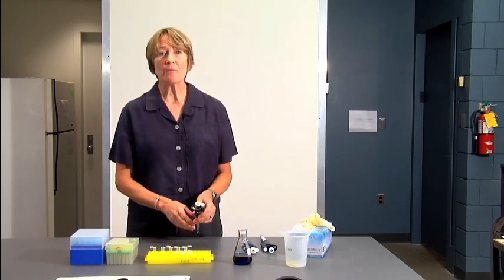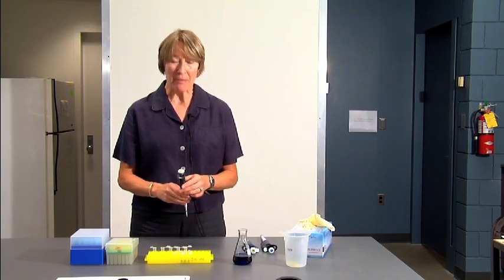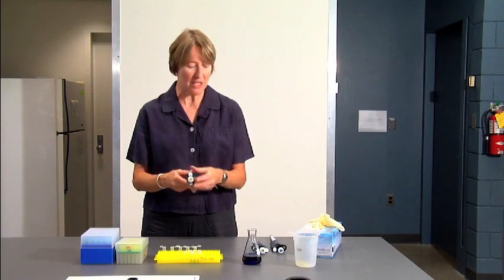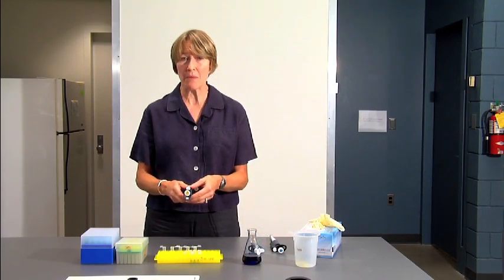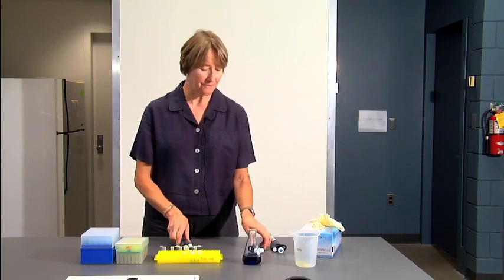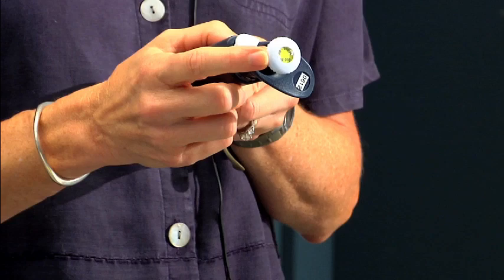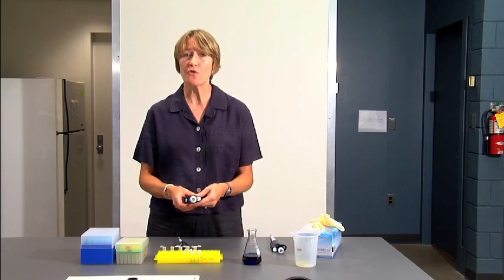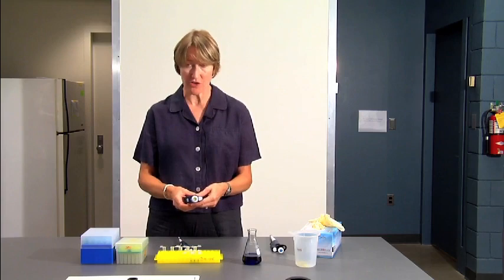In lab, we're going to be using three different sizes of micropipettes. A P20, and you'll notice that on the top of the plunger, it has the size of the pipette. It says P20. This delivers 2 microliters to 20 microliters of fluid. We'll also be using a P200. Again, P200 is listed on the top of the plunger. P200s are used for measuring 20 microliters to 200 microliters of fluid.